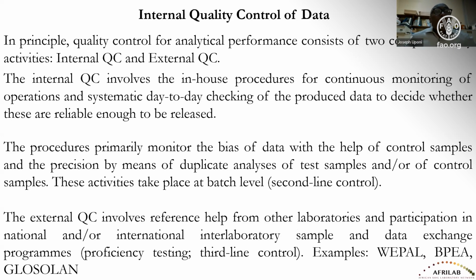It's very, very important that when we generate our QC charts, there has to be a systematic way of checking this on a day-to-day basis to be sure that whatever we are producing is reliable. That an analysis went well yesterday doesn't guarantee that it will go well today. And that's why oftentimes for the lab manager, you often include things like blind samples. Blind samples are samples that you already know the value, but the analyst doesn't know the value.